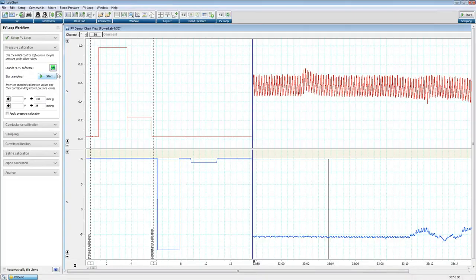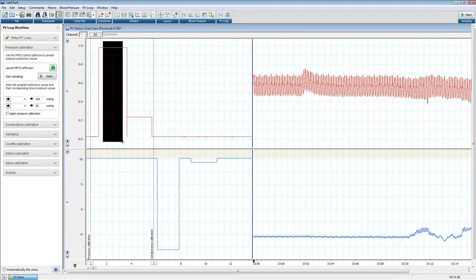So we're going to pretend we've gone ahead, we've recorded this first block here, and we've recorded our pressure calibration outputs. So we've already recorded, and we want to go ahead and do the pressure cal. Here's our first pressure that corresponds to 100 millimeters of mercury. Go ahead and select across it to where we're nice and stable. So a couple of seconds of data here, a second and a half looks like what we have. Move over here, left click on this arrow. It averages across the selection and applies that voltage value equals that millimeters of mercury.